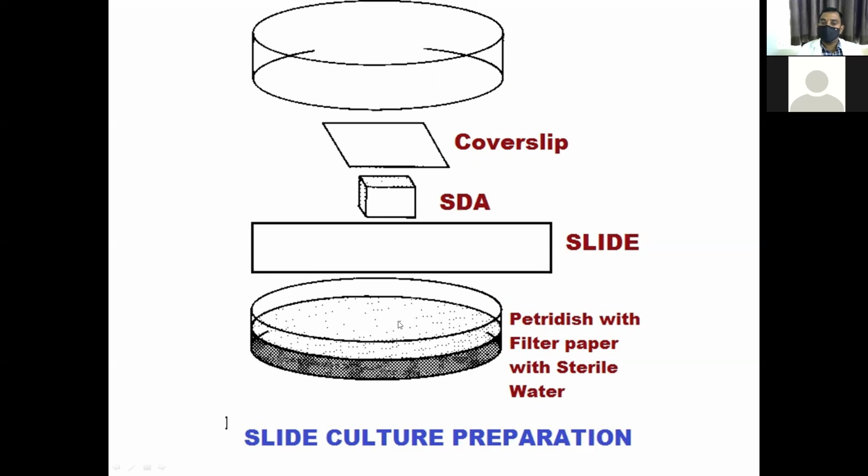This slide culture technique preparation was done by our HOD Professor sir, a small demo video on how to prepare a slide culture. You will see that video after this. After a while, when you come back to college, you will follow all the practicals and do them with your own hands.